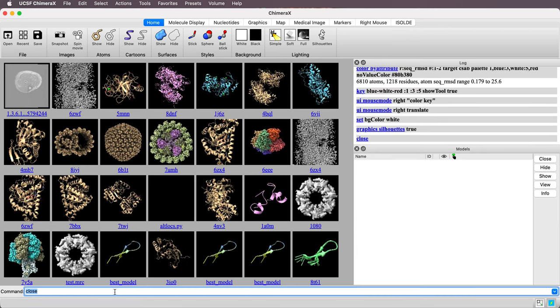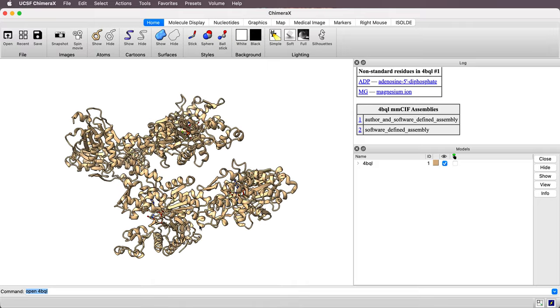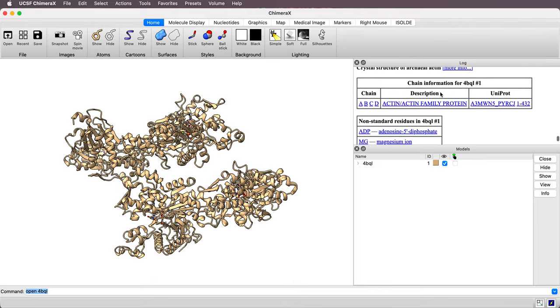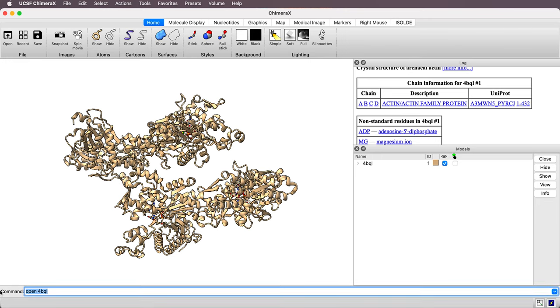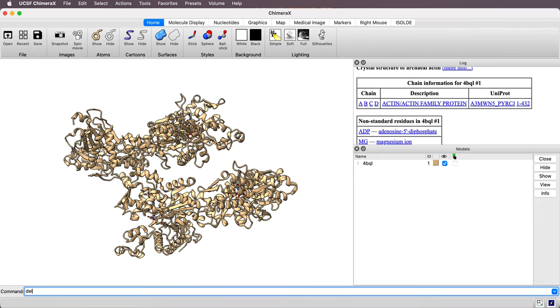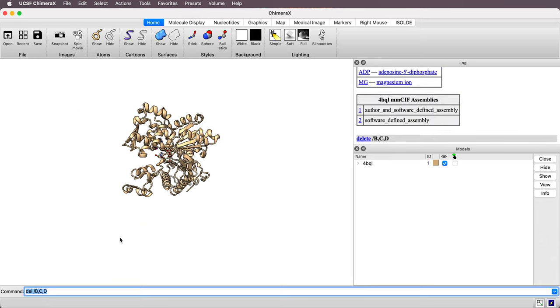We're going to look at two actin proteins. Actually one is Crenactin, an archaeal version of actin, and its PDB ID is 4BQL. And there are four copies of it. I can see in the log over here, chain A, B, C, and D. So first thing, I just want one copy. So I'm going to delete chains B, C, and D so I have one copy.